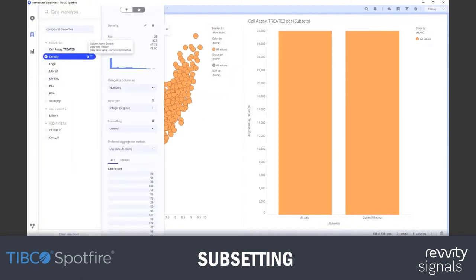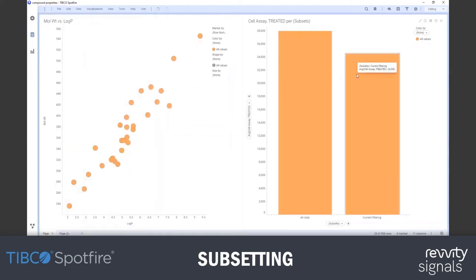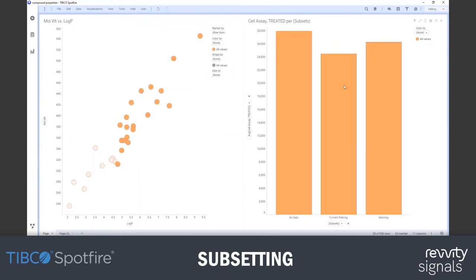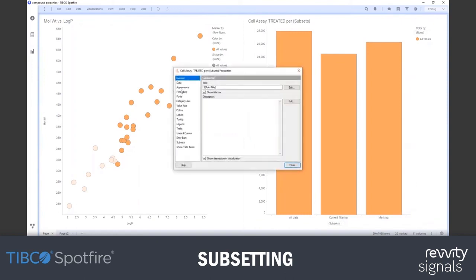Now when I filter for only compounds that have a high density, you'll see that those compounds above, let me enter a threshold, I can double click this lower limit here and pop in 100. They're averaging about 24,500 for the assay, and the average for the whole data set is 27,948. But I can also make a selection, for example, of all these records at the top here, and then I can see what the average assay result is for my marking as well.